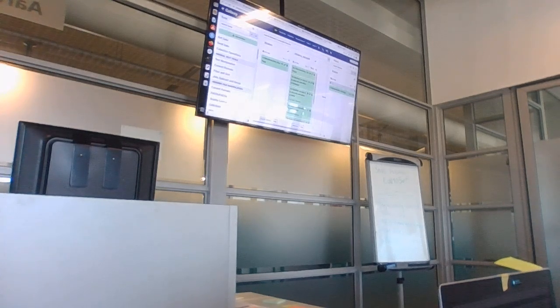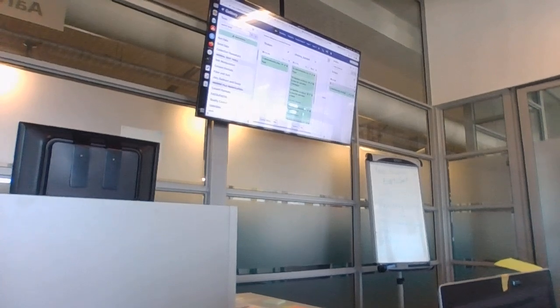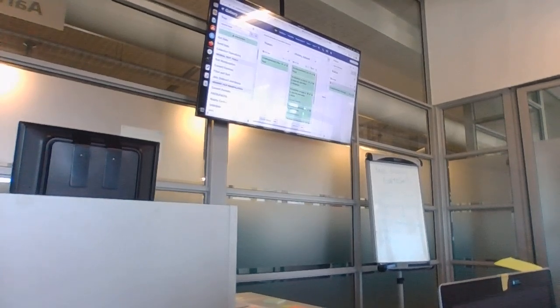So this is the data set. So let's add this and let's select it. So let's do this again. Switch to. Is it on there? So now I'm looking for this one. I have the same problem because I didn't see that with the update.